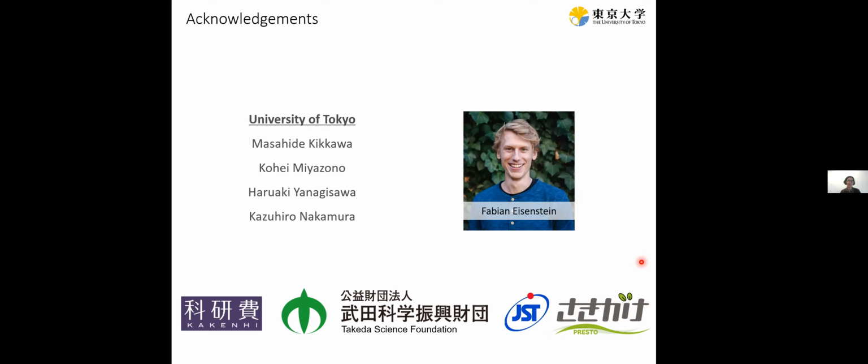All right, I think Melissa also had a question. If she wants to ask that herself, or else I can read it. Thanks, Rado. That was a fantastic talk. Particularly, I enjoy your technical detail, which is sometimes missing in some of these talks. I just had a question about your GPCR in complex with the nanobody 35. You said that it gave improved resolution because of the improved stability. I was wondering how you pre-screened those nanobodies for stability enhancement. Are you using HDX? Are you doing something else?